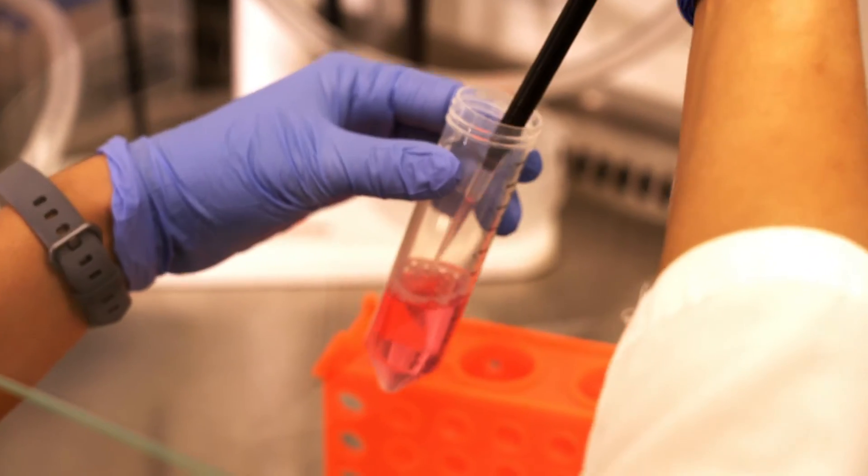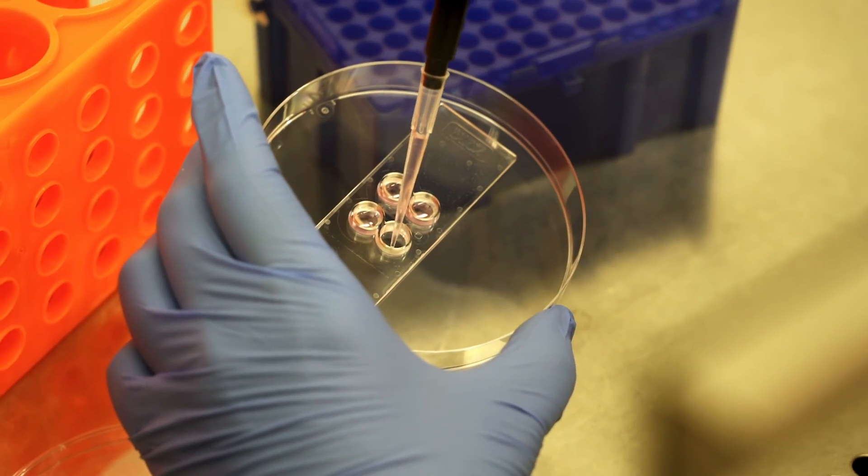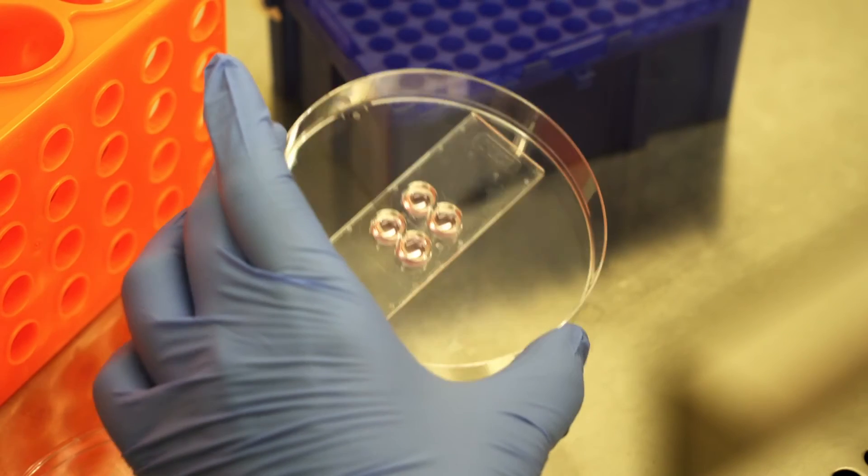Other products can be a little bit hydrophobic, so it's not as easy to get liquid into the device. With the Zona chip, liquid flows in readily, so it's an improvement and a much more user-friendly platform.